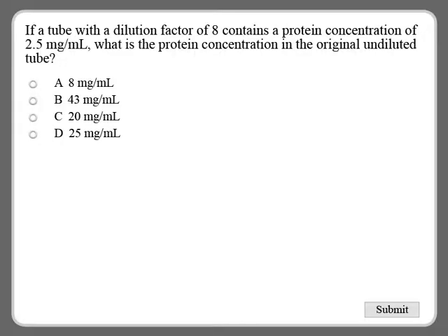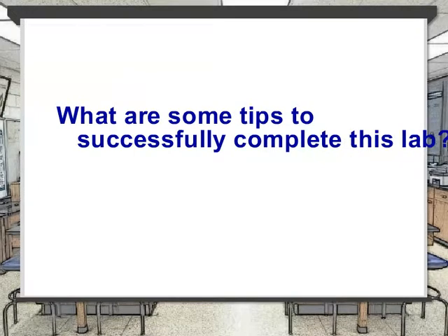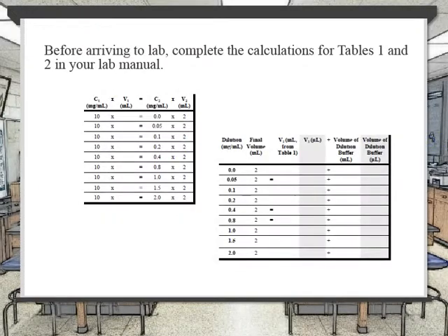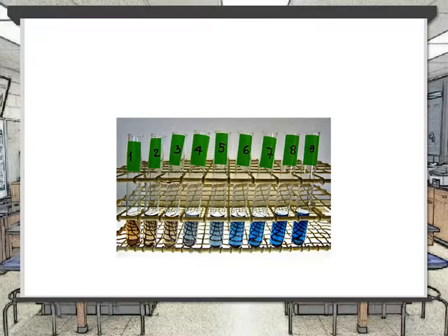When you get ready to measure your samples, the samples do get put in a special holder called a cuvette. This is a square holder that will slip right down into the spectrophotometer. You will notice that there are different widths to the cuvette depending on its orientation.